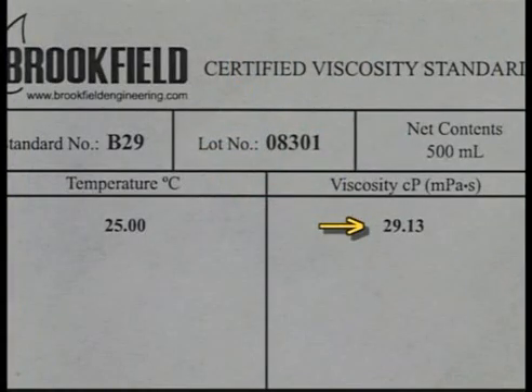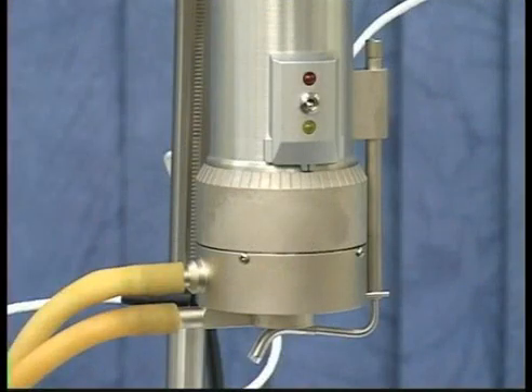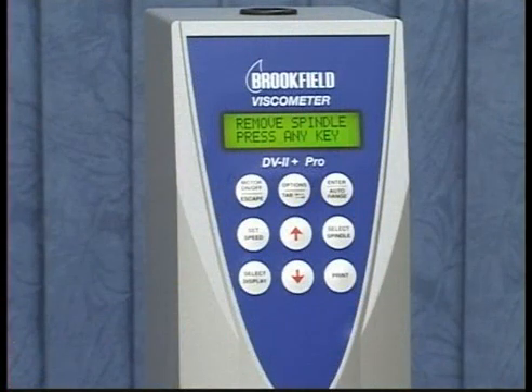Use the actual value of the fluid for the calibration check. Make sure the instrument is level. One of the most critical aspects to ensure accurate measurements with a cone plate geometry is properly setting the gap. The first step is auto-zeroing the instrument.